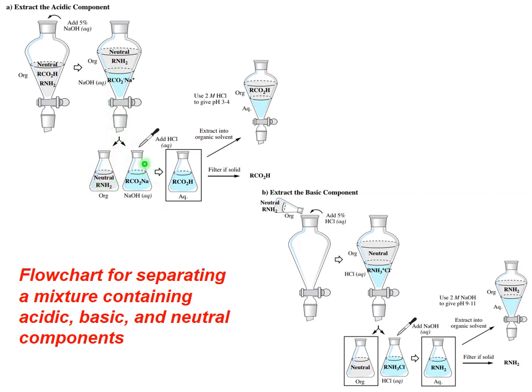My acid goes into the aqueous phase. After acidification of the aqueous phase, I can bring my acid back into organic and then go with further analysis.